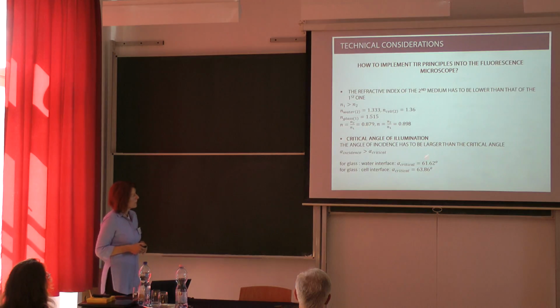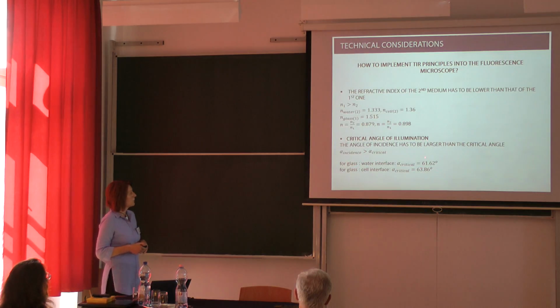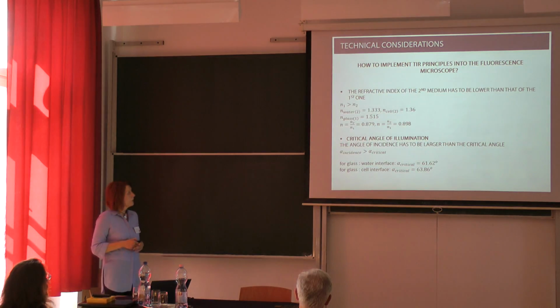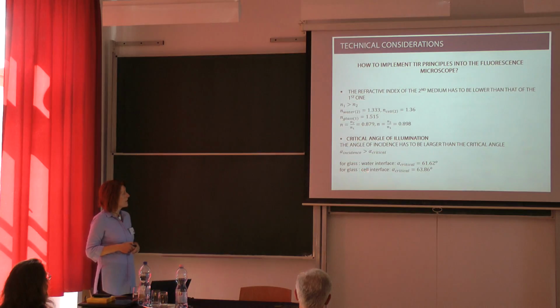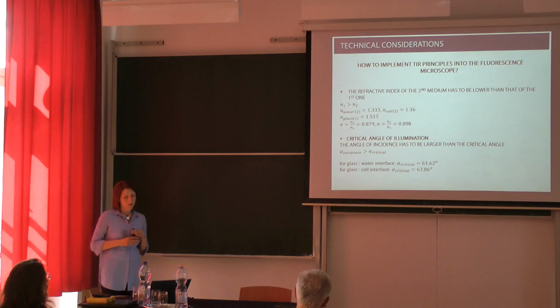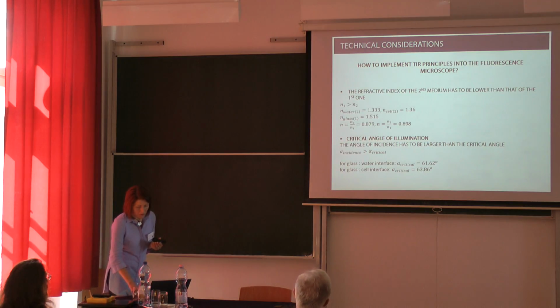For a glass-water interface the critical angle is about 61 degrees, while for a glass-cell interface it is almost 64 degrees.